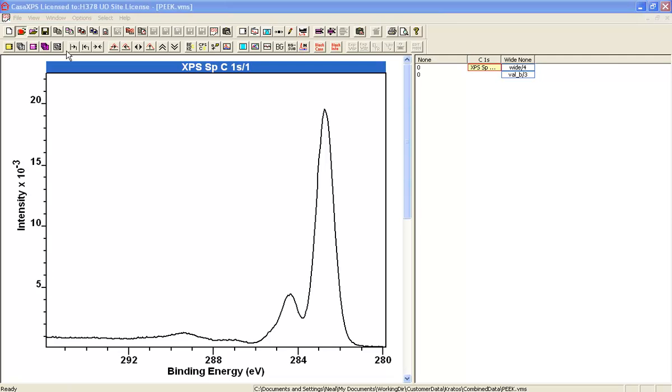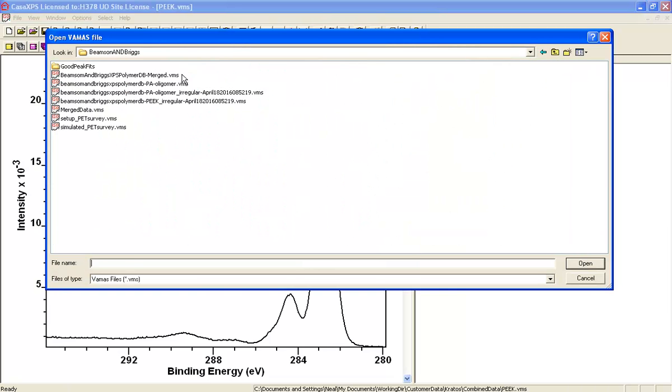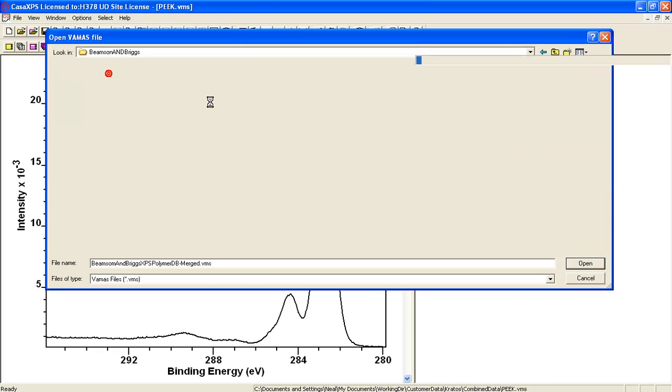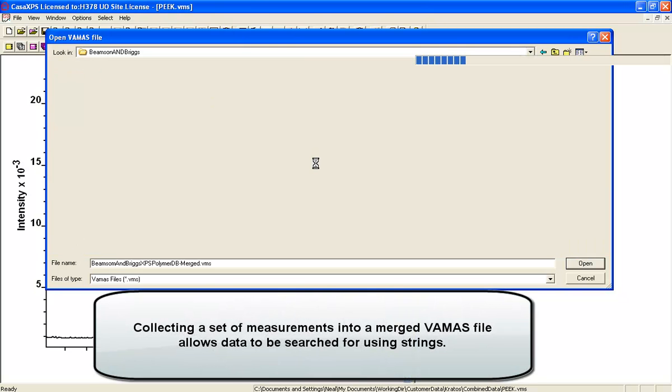Now I've already got a merged version of that, so let me go up directory and we'll go for the merge database and load this file which contains all of those VAMAS files. They're all organized so that I can search for the information that I'm interested in.